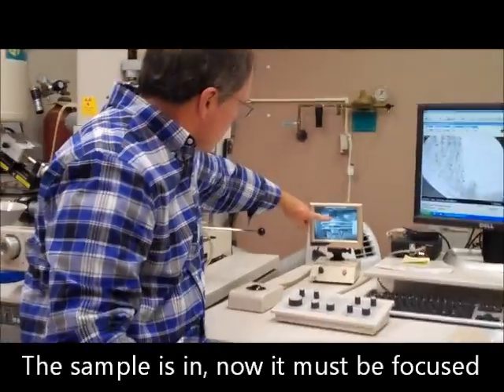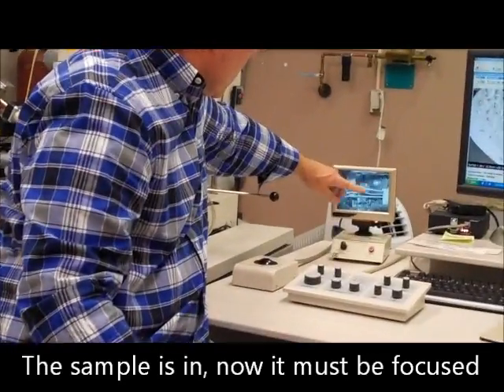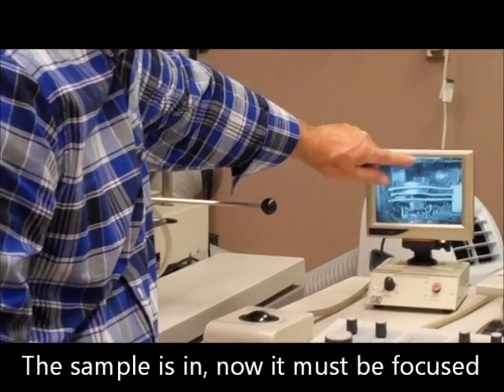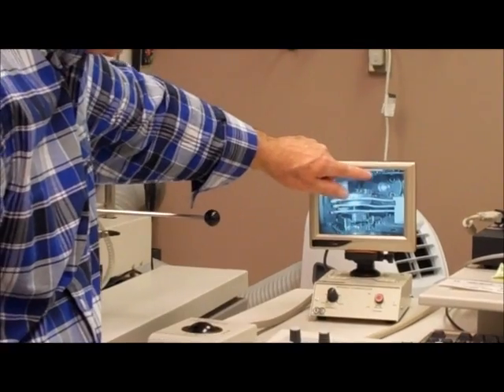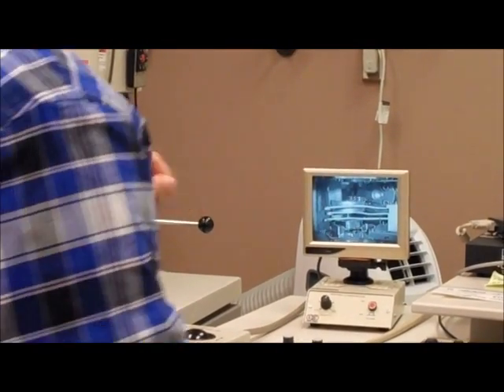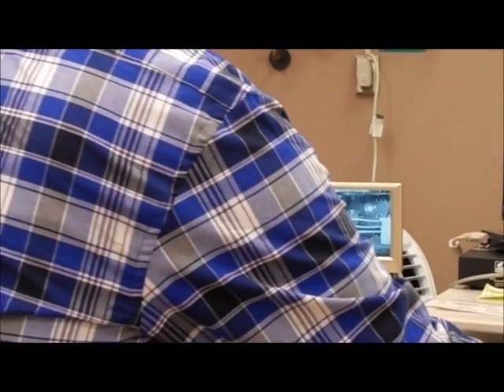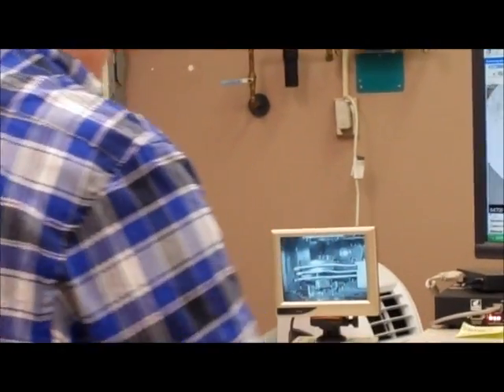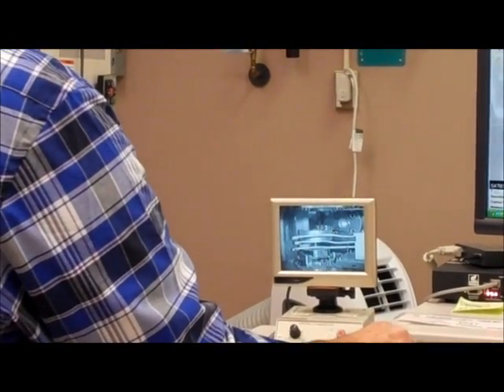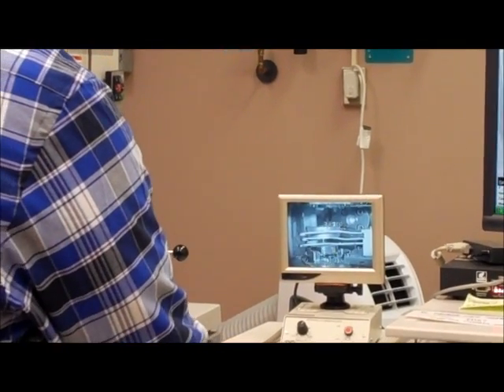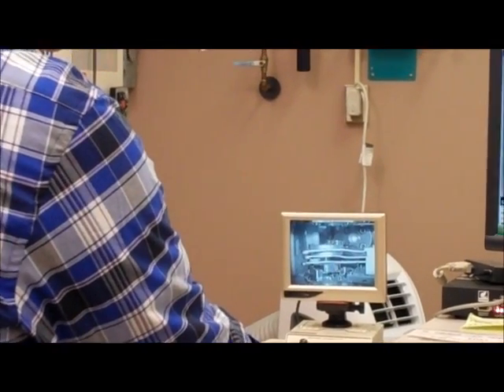So here's, these are the samples right here, and we're going to move this up closer to this, this right here at the top of the screen, which is the objective lens. So the trick is, and I got lucky, this is pure luck.